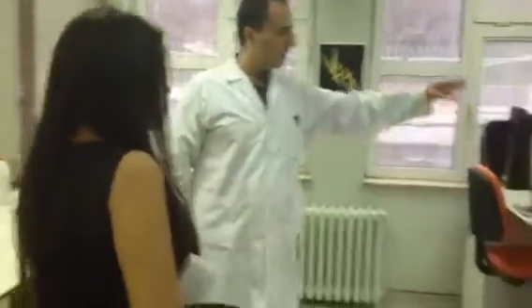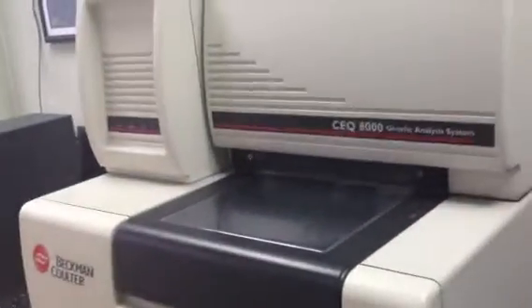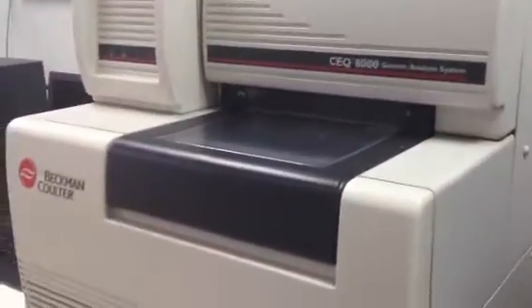The sequence analysis is the DNA analysis room. For example, the samples are prepared in other rooms and enter this room, and the samples are put in the sequence analysis machine, and the machine works 1 or 2 hours.